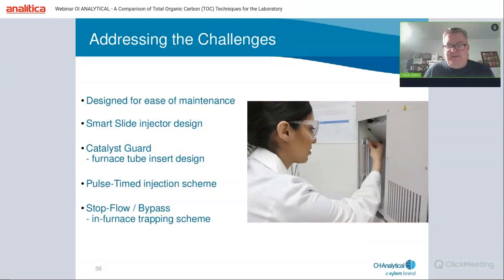Here's an example where the desiccant dry tube is, and then also that is the halide scrubber that I mentioned. As the CO2 goes through both of those, we like to dry that CO2, and then ultimately it goes through the Nafion tubing with our perm tube and onto the NDIR. So I like to dry out that CO2 as much as possible.